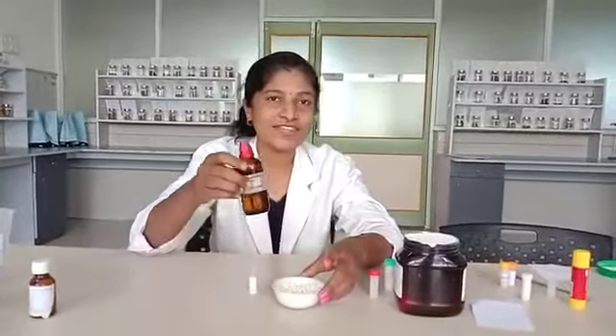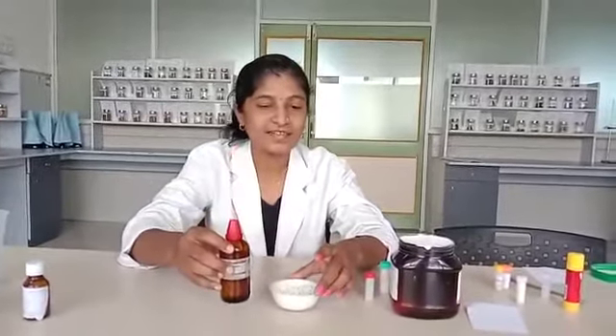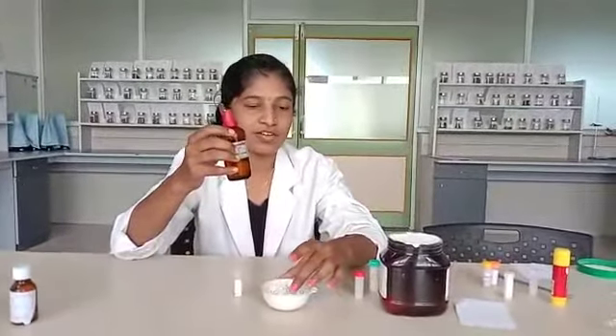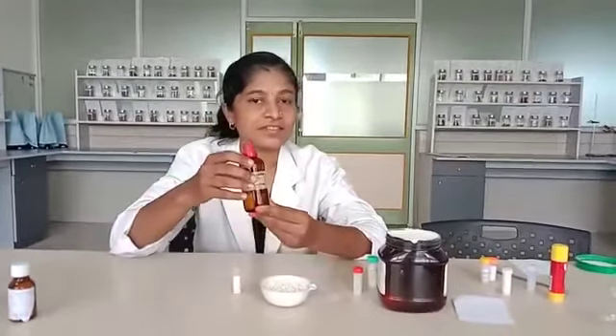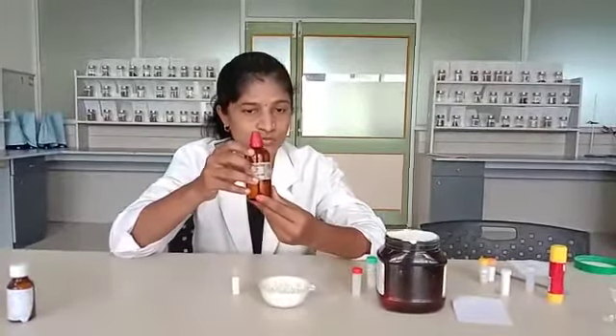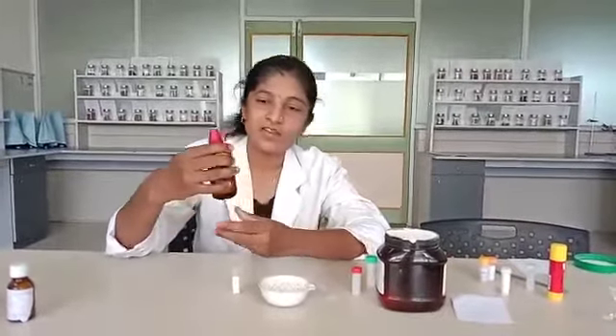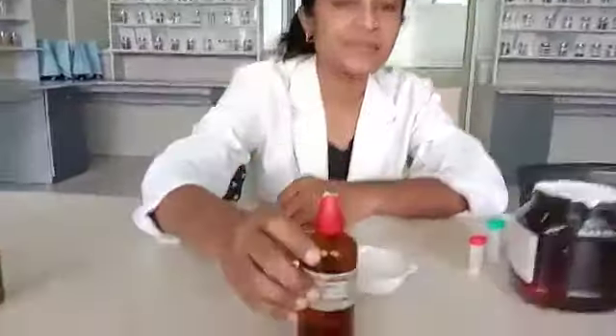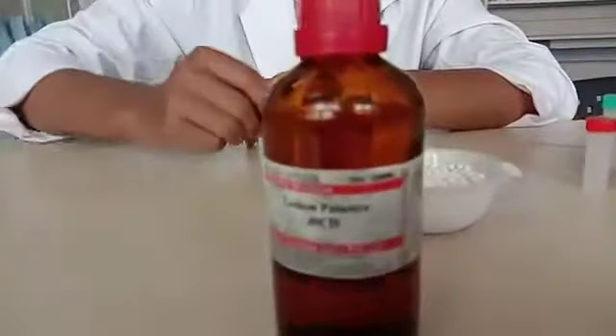We see the dispensing of liquid potency. Homeopathic medicines are available in liquid form, they are called liquid potency. The aim of today's practical is dispensing of Lachesis 30, so this is Lachesis 30 solution.